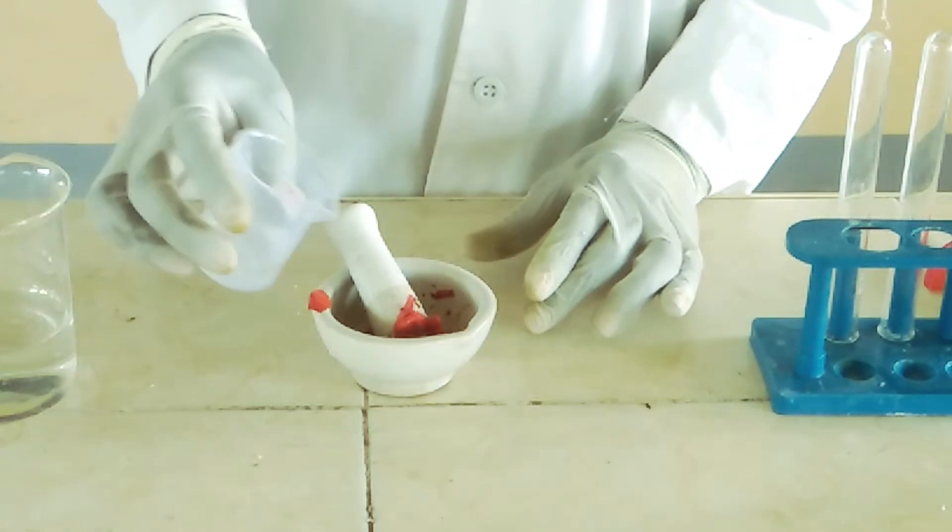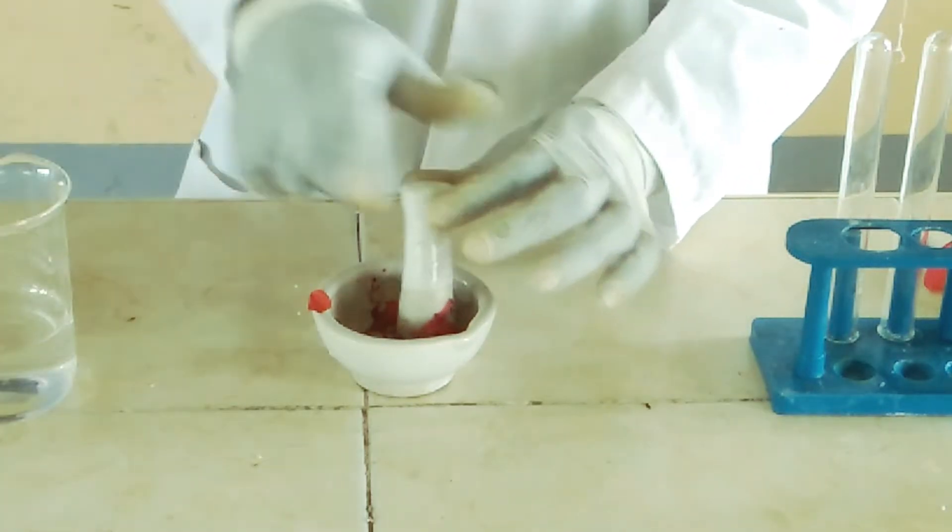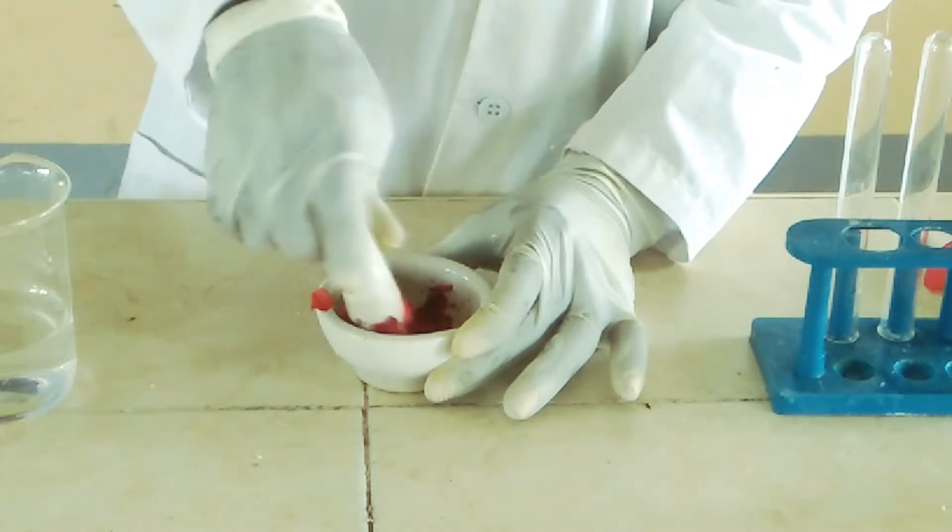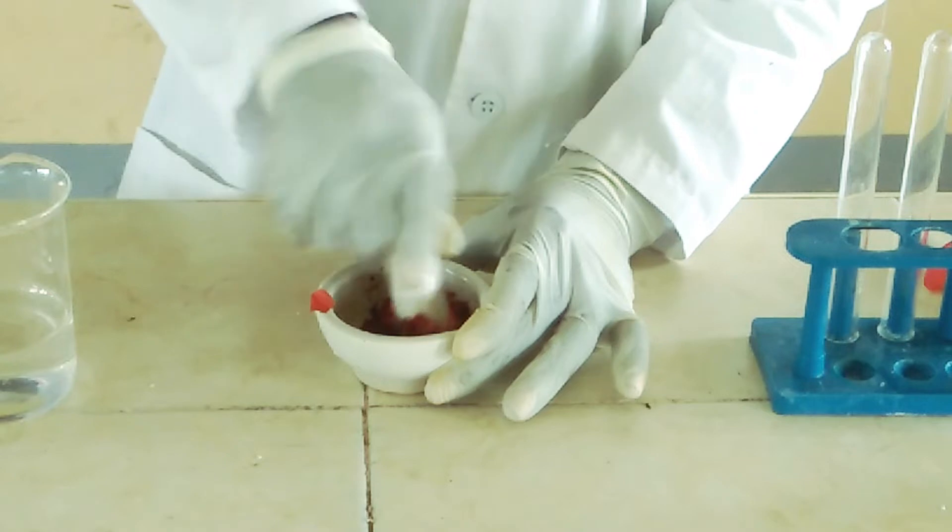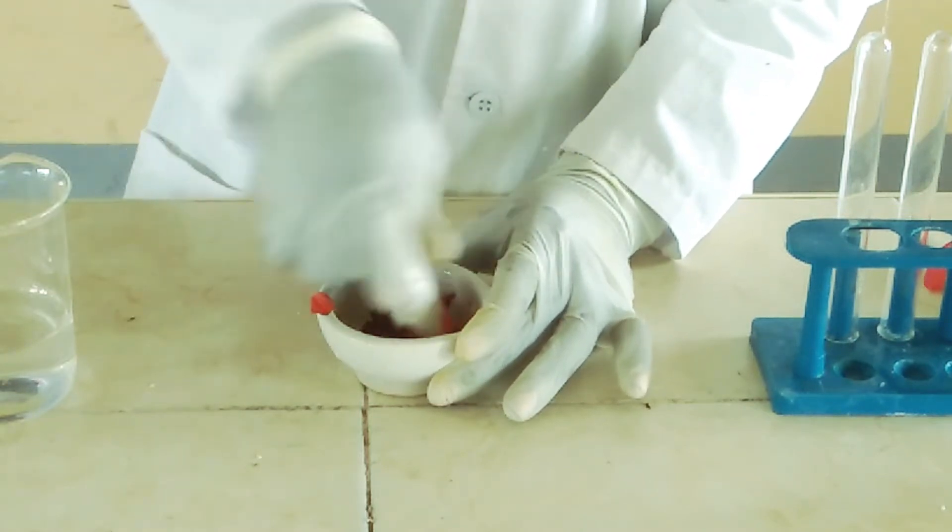Then I'm going to add some propanone into our crushed substance. You can also use ethanol. In case you don't have propanone, you can also use ethanol, which will still give us the same extract.